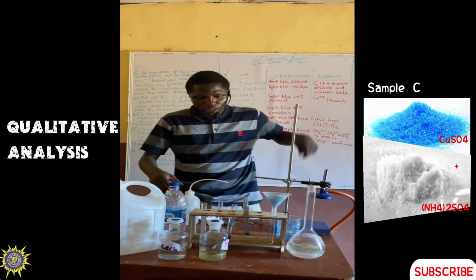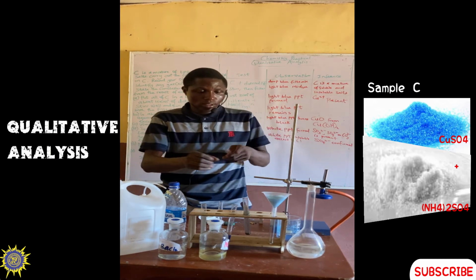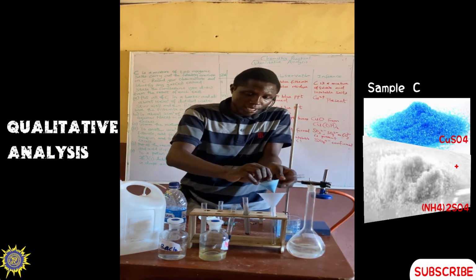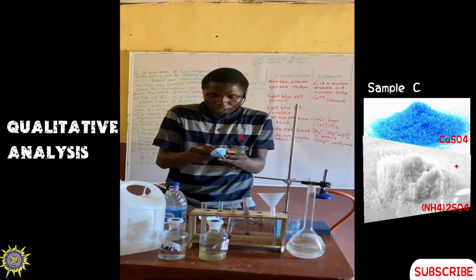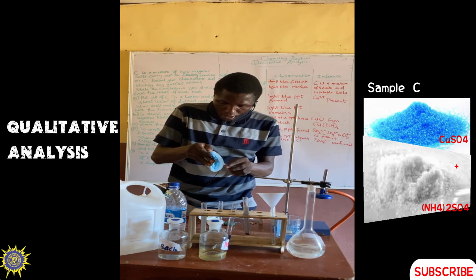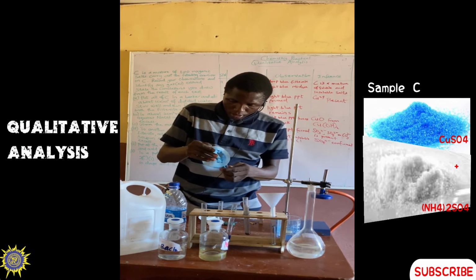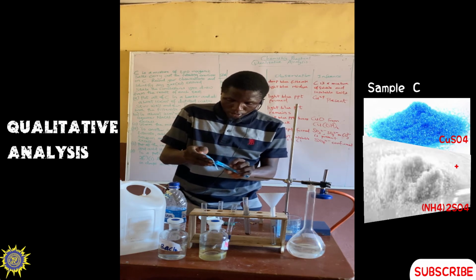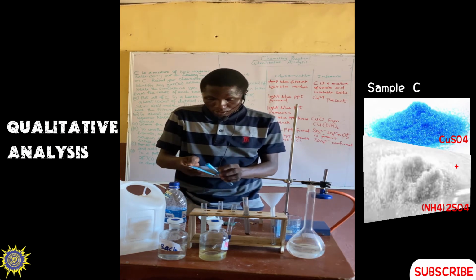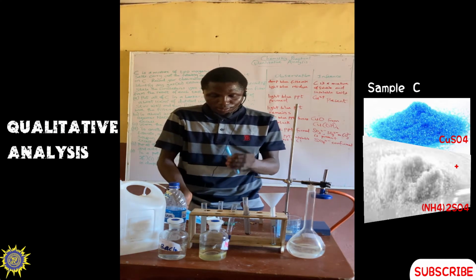So this is a clean test tube now. Make sure your test tube is clean as instructed. So now add all of the residue here. I've added it now. So make sure everything enters.